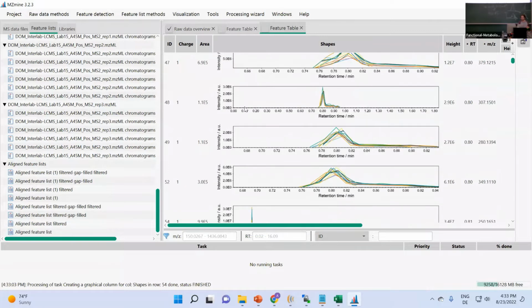So particularly, while going through and talking to some of you, I've seen that sometimes the feature numbers, so basically the rows of features in the CSV file, might have been much less or much more than what Robin produced. So be aware of the complexity of your sample and think about, okay, is that a realistic number of features I got here? That could be a first type of quality check.